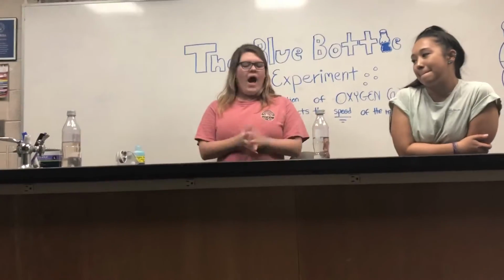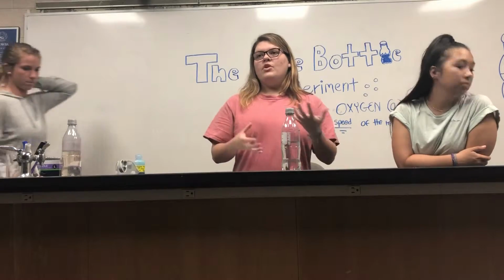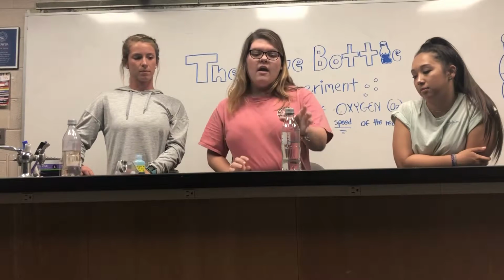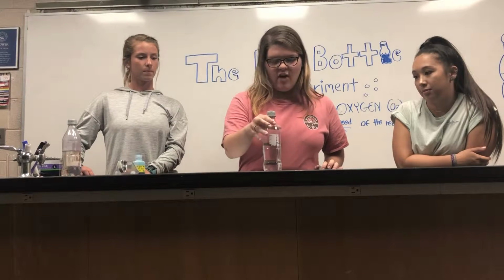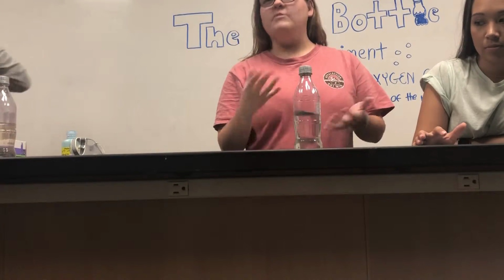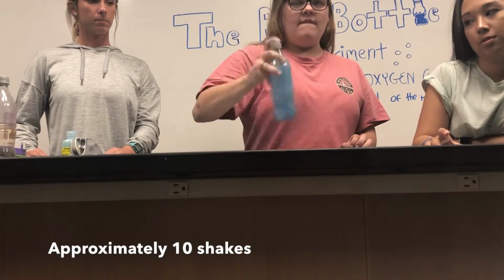In order to show how the concentration of oxygen affects the speed of this reaction, you can shake it up more or less, and it should affect the rate of fading. So we're going to try to time this and see how long it takes to fade when we shake it up different times. Okay, so we're just going to do this one time just to see how long one reaction takes, and usually it takes around about 30 seconds, so we'll see.